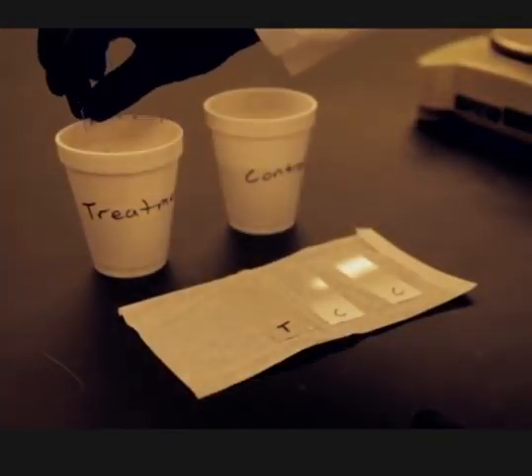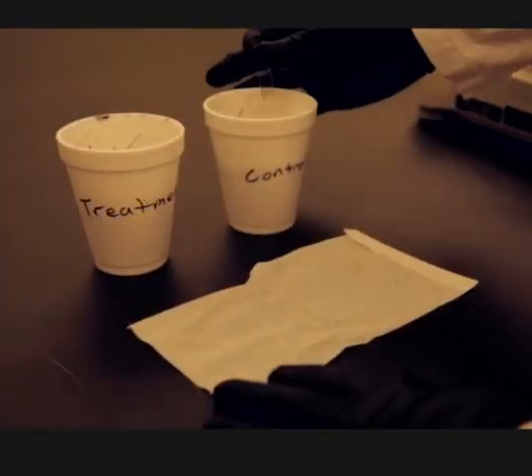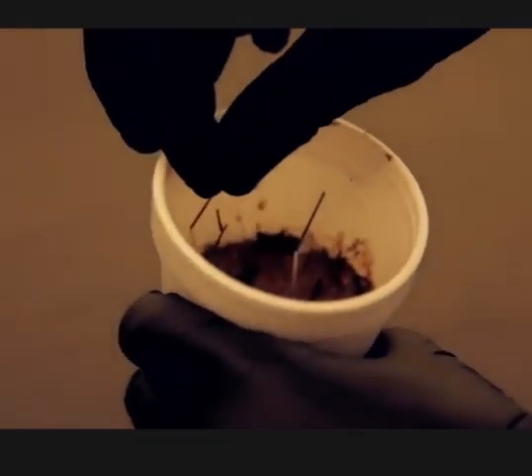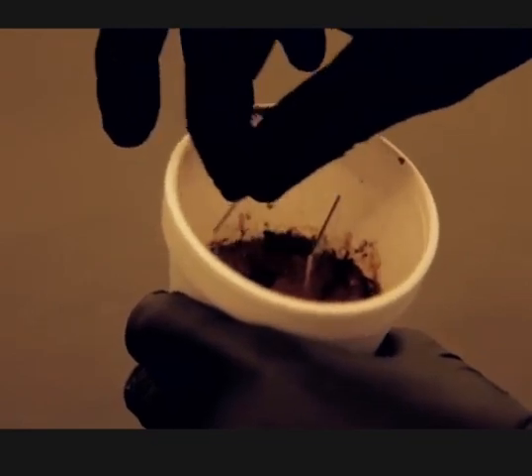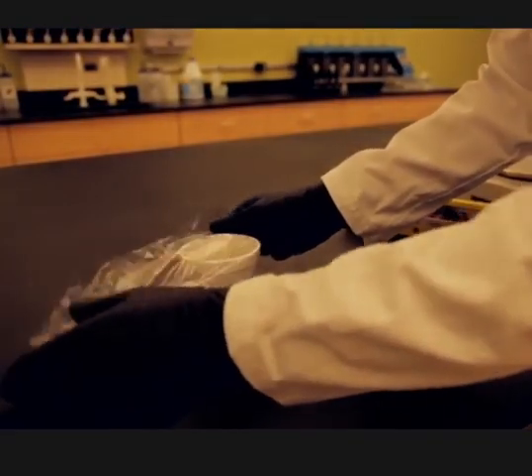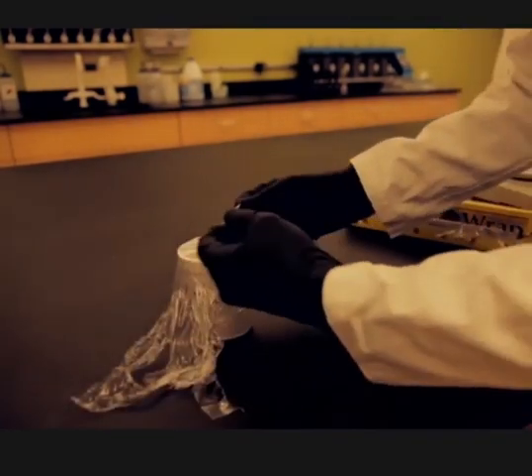Next, label 4 clean microscope slides, 2 as treatment and 2 as control. Insert the 2 treatment slides into the treatment soil container. Leave a section of each slide exposed above the soil surface and ensure that there is a gap between the 2 slides. Cover the cups with plastic wrap and secure with a rubber band.